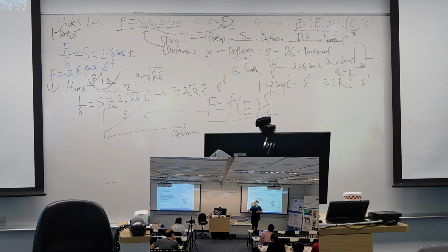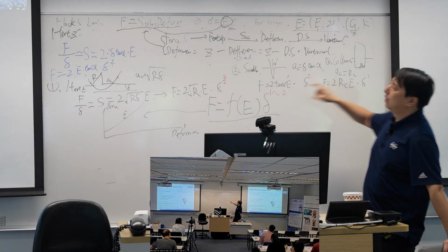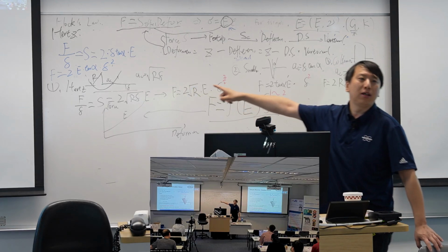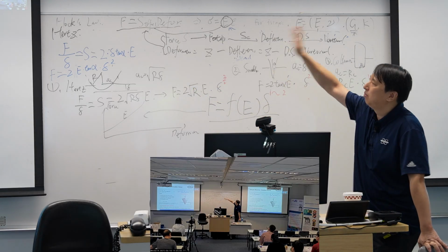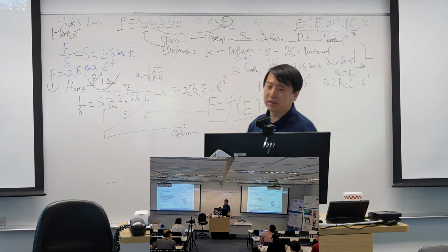No, the diamond is defined by the crystal structure of itself, right? Which corner you are using on the diamond. So for that kind of probe, it's hard to get the contact radius out directly, and hard to use a mathematical approach to deduce it.